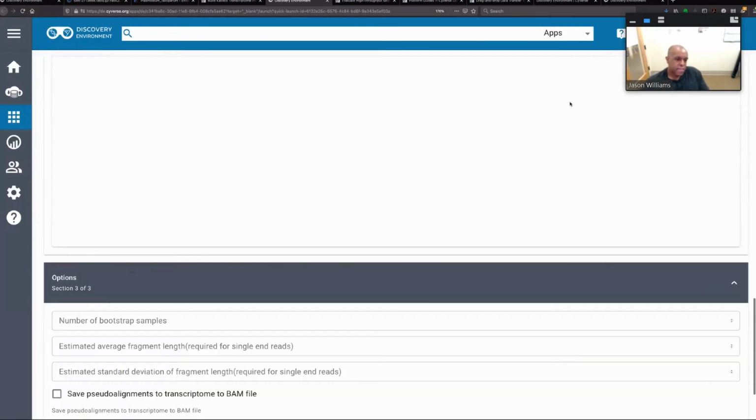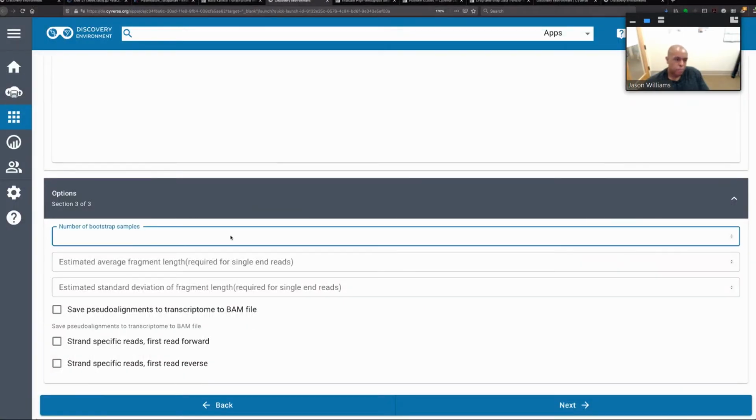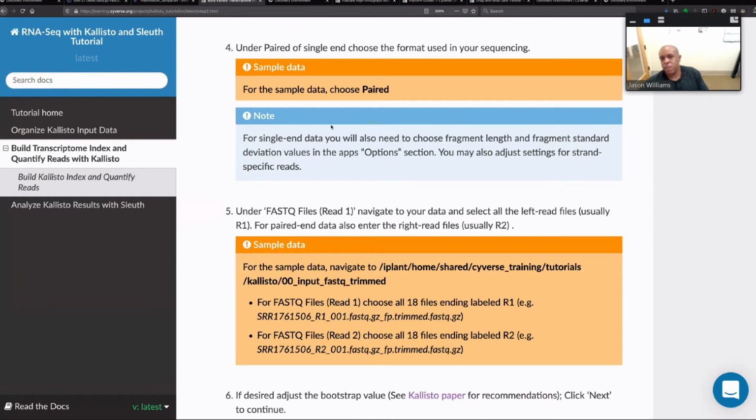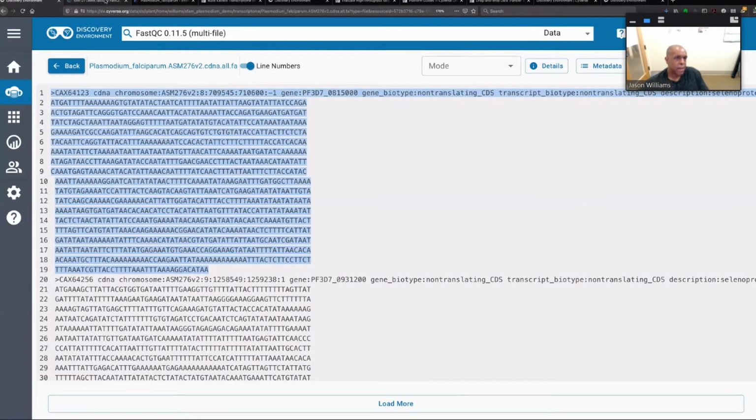And the next thing are a number of, but not that many, different parameters. These are described as you read through here. This tells you for a different data set, but it goes through what parameters to use and also points you to the paper for specific recommendations. So I'm managing my windows. I've got so many things open.